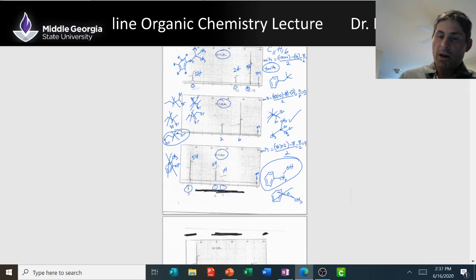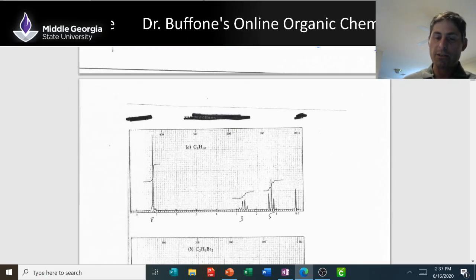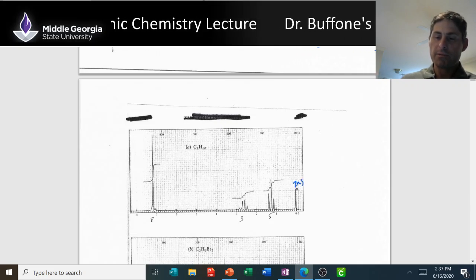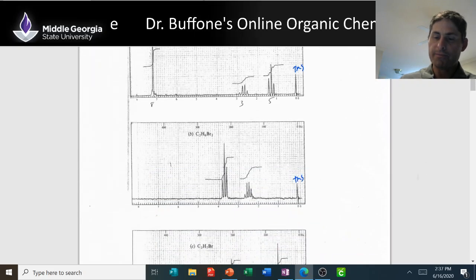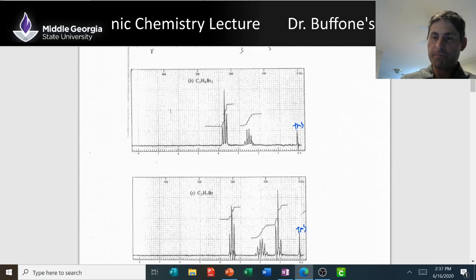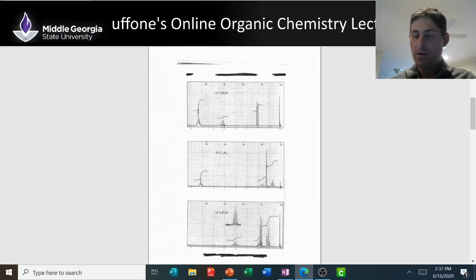Okay, so you will do the rest. You will look at the molecular formula, get units of unsaturation. Look what we have here. Now we have some splitting. Don't be fooled with the TMS deals, right? I see TMS in all of these. These are some old school spectra. And then the rest are for you to do. And I think at this point you can do them.